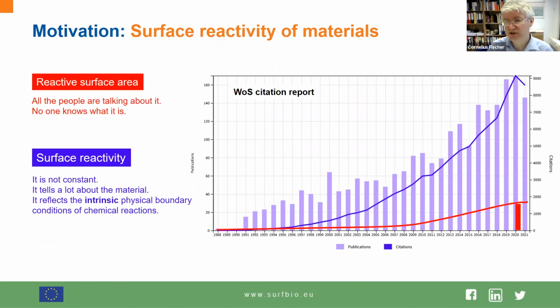So it might be something about surfaces that do contribute or not so much contribute, and they came up with the concept of reactive surface area. And when I was a student, all people said, yeah, we want to analyze reactive surface area values. That's what we need to do. But there's, of course, no technique to do so.